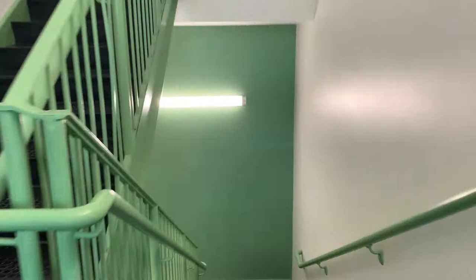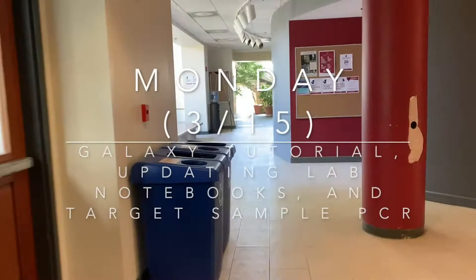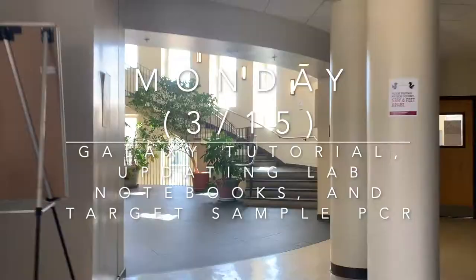In today's session, I'll be making progress on the Galaxy tutorial, updating my lab notebook, and using PCR to amplify my target barcoding samples to run on a gel for DNA confirmation.